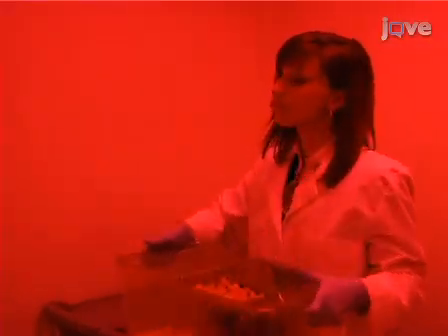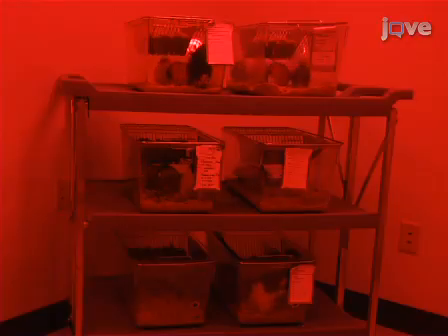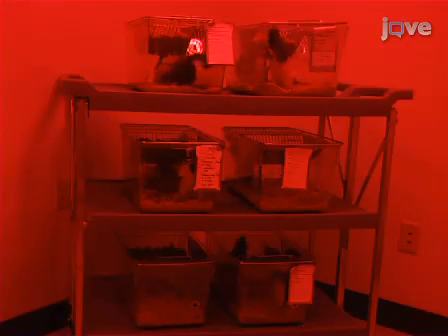To begin, bring a single male rat into the training room. All other males should be kept in an adjoining room until their training session. The rat should have restricted access to water beforehand to facilitate the use of water as a reward during training.